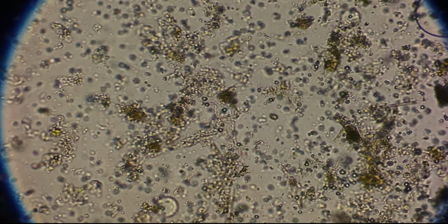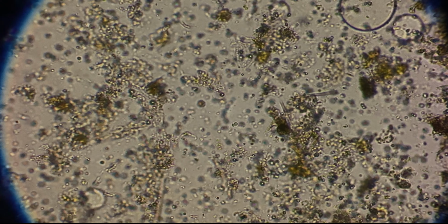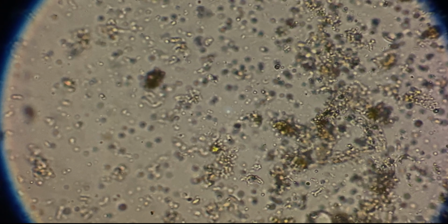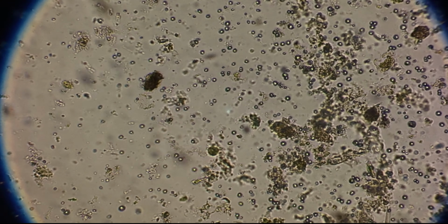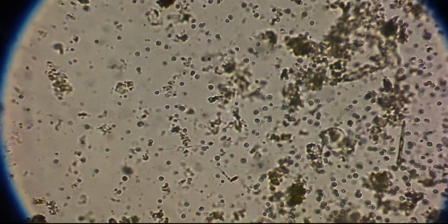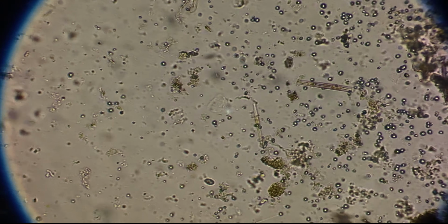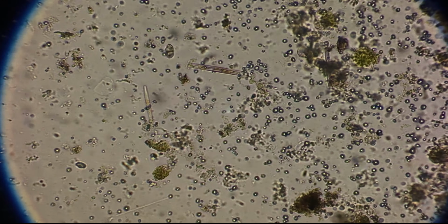A few seconds ago, this whole area was full of movement. Now look. Some organisms have slowed down. Some are barely twitching. But over here, over on this side, we've still got a few holding on, swimming like nothing happened. Why would that be?